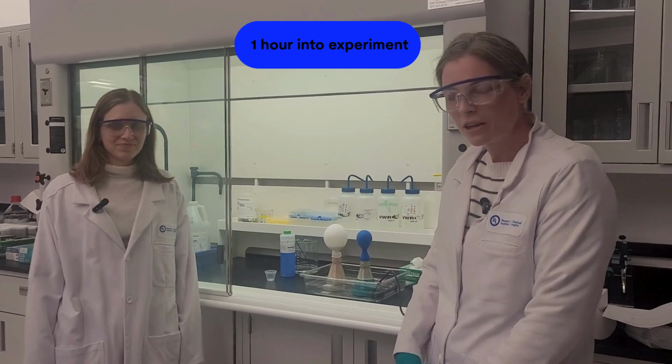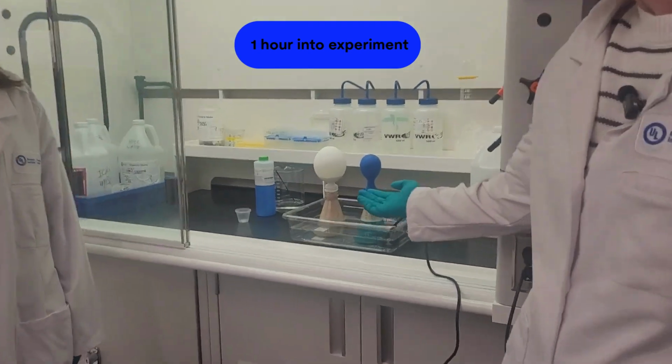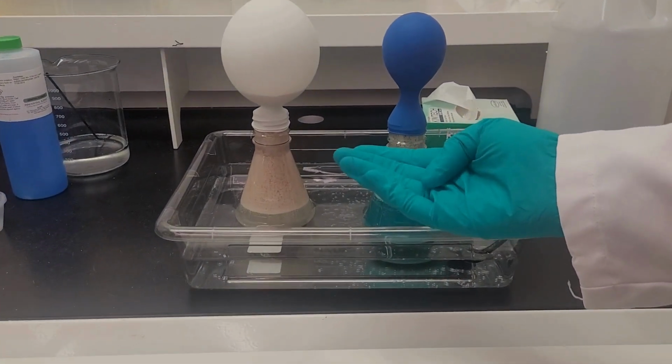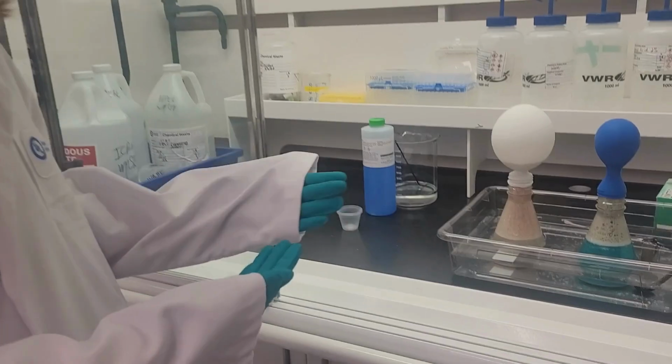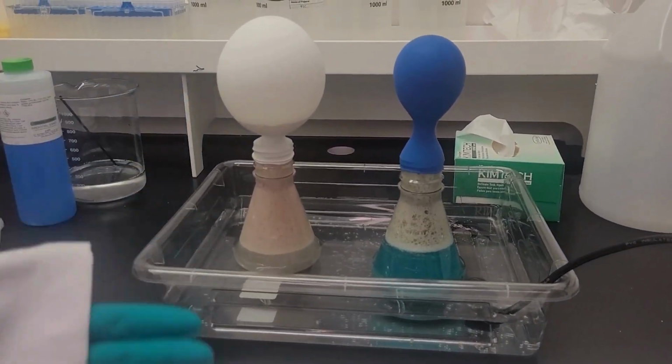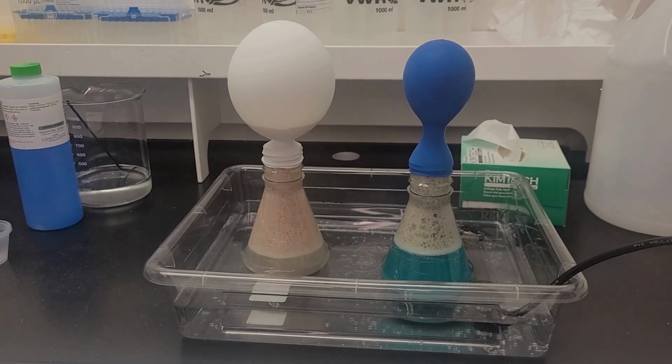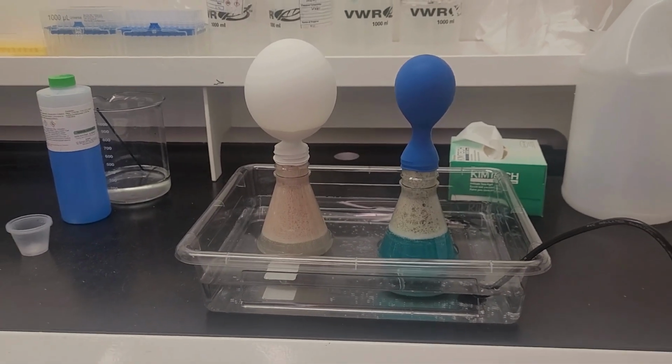All right, we're about an hour into the process, and if we look at our flasks over here, we can see that our healthy cells in flask 1 were able to blow this balloon up more. Why do we think that is? It looks like our healthy cells were able to undergo cellular respiration and produce energy as usual, so they produced a lot of gas to blow up this balloon. But these cells that were mixed with our toxin were not able to produce as much energy, so the balloon stopped growing.